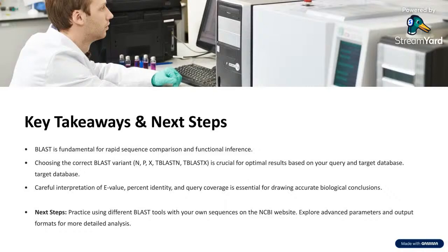Mostly we use the lower e-value, like 1e-50 or smaller. That is much more reliable for our query.